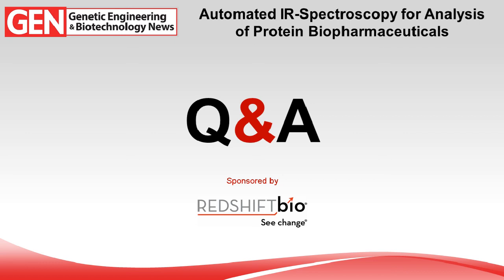So we were not able to do the far UV CD in the true formulation. We have to remove these two interfering excipients to do the far UV CD, but the regulators really want to know in the presence of these two excipients what it looks like. So we did some feasibility study with MMS. It turned out to be very superior.